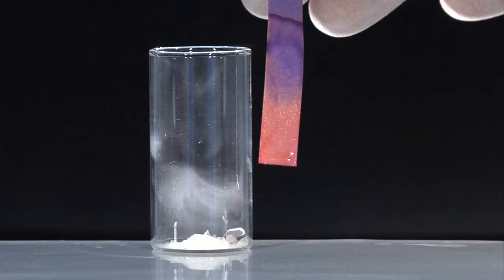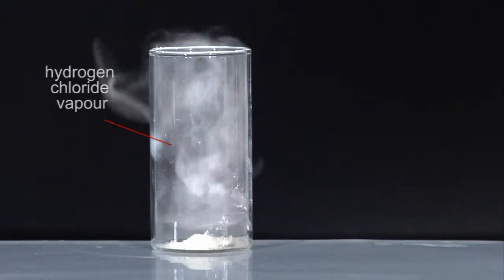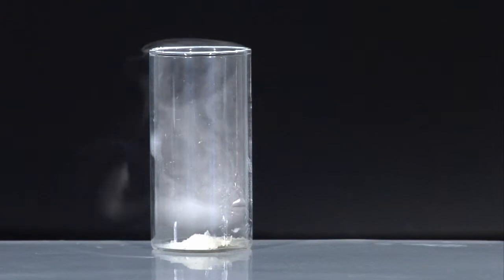Pure hydrogen chloride vapour is colourless. The misty appearance of the hydrogen chloride is due to water condensing in the region of the hydrogen chloride vapour.